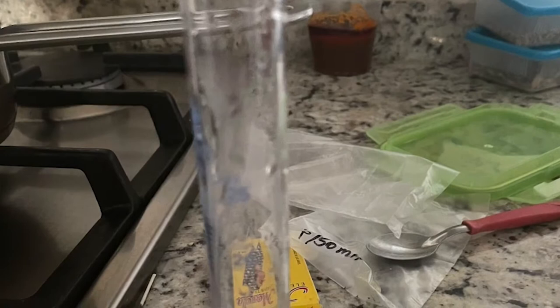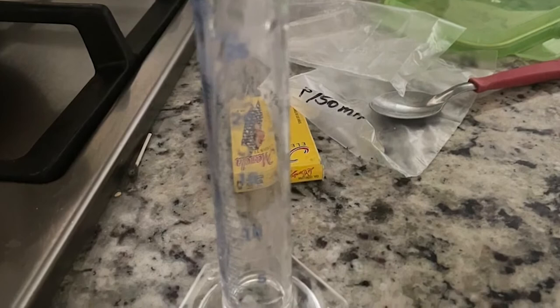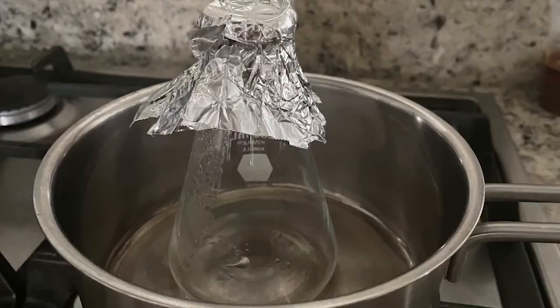8.33 milliliters was used, dissolved in 50 milliliters of sterilized distilled water. They were allowed 15 minutes before starting the 3 subsequent rinses.